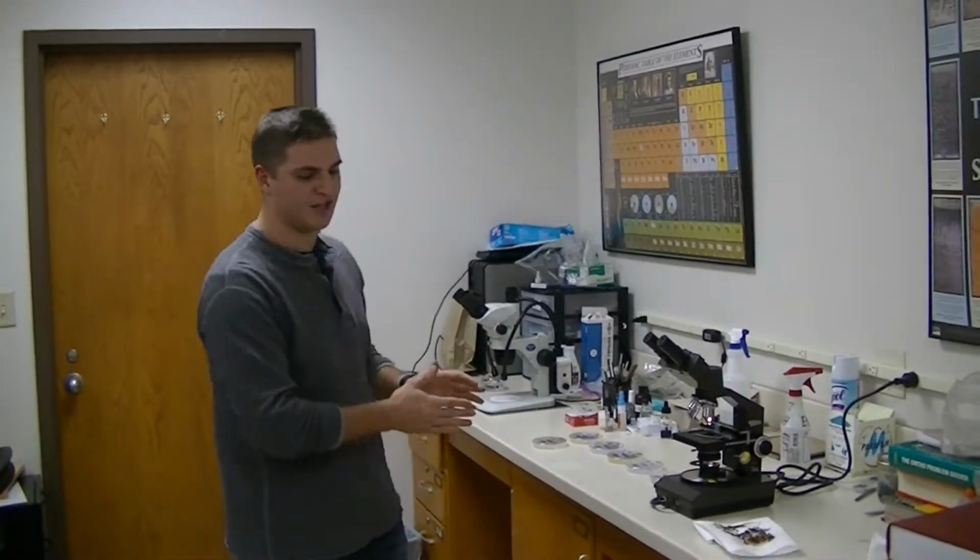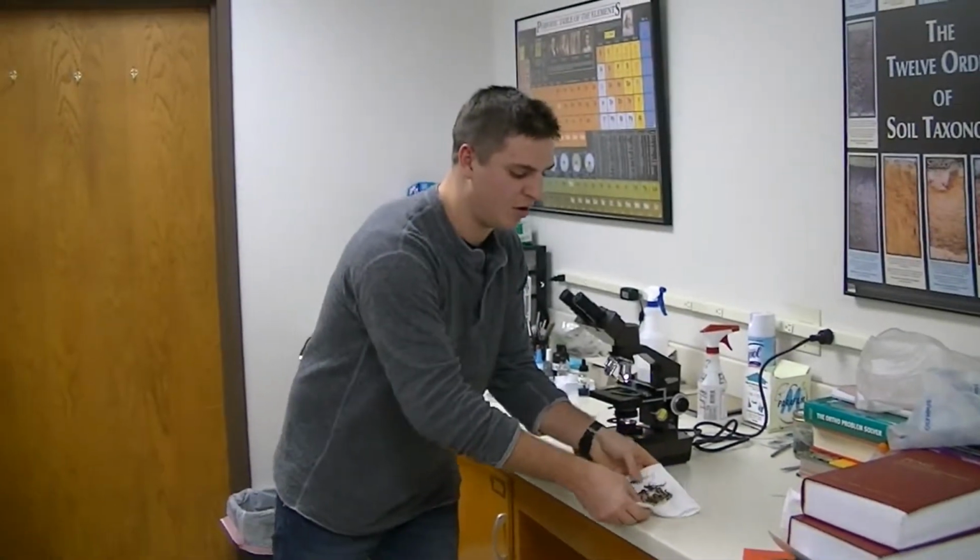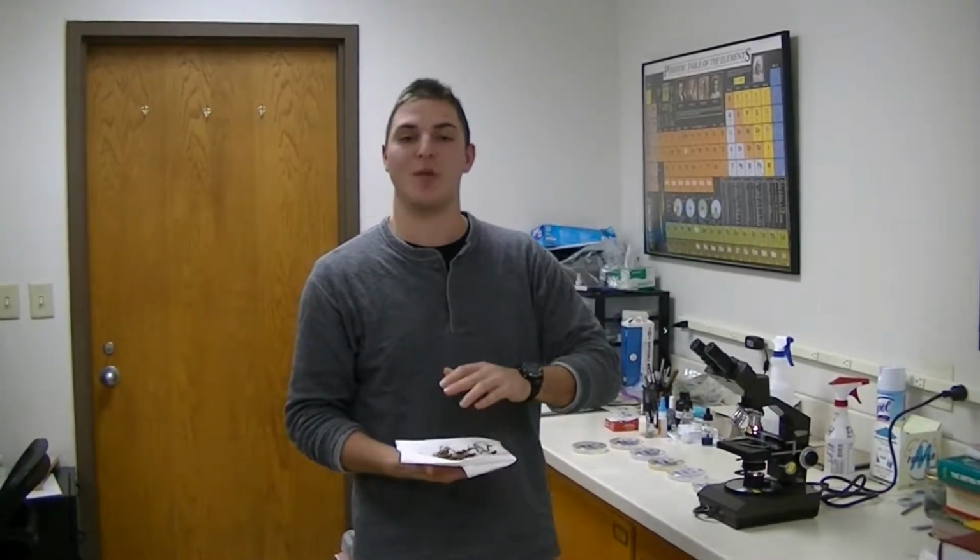So we've left the washing station, and now we're at the plating station. This is the first step in our selection process. So we've cleaned the roots, we've dried them off. Now we have to select roots that are nice and partially alive. If you pick roots that are partially dead or entirely dead, you're looking at secondary saprophytes coming in.